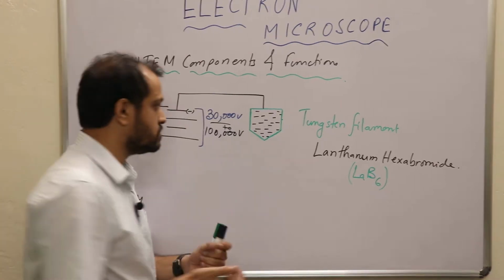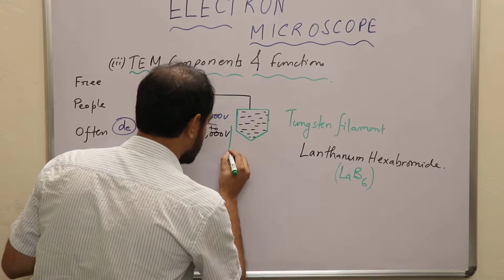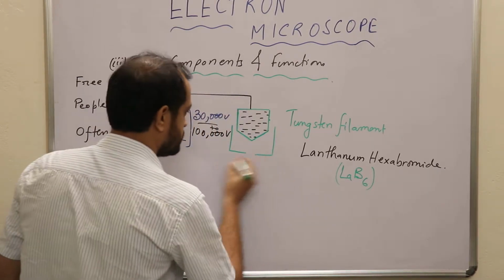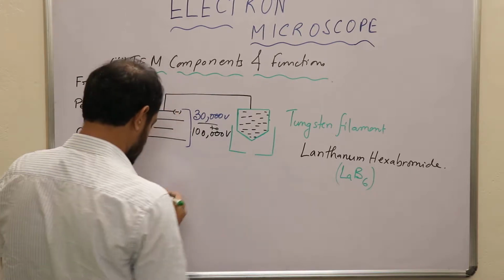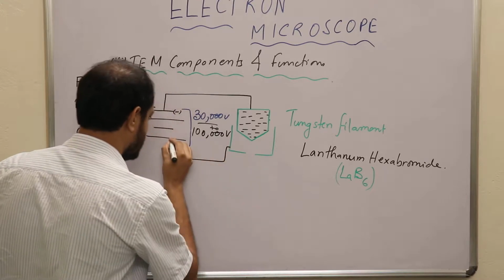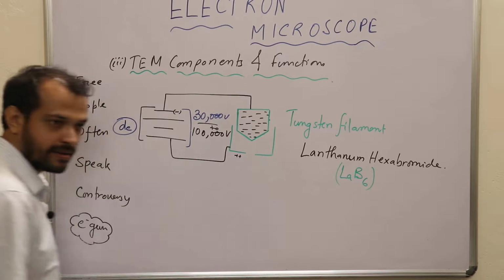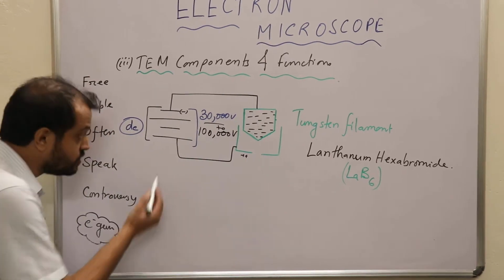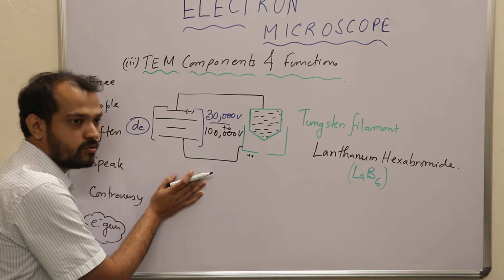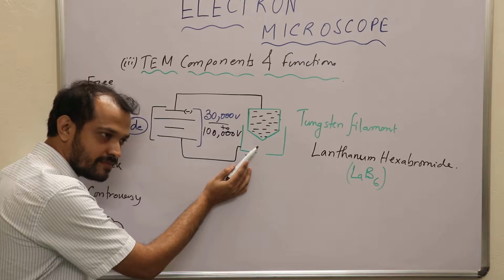Okay. So what we have done is we have produced another thing, a casket-like thing, and this is connected to the positive terminal. That means this is positive, right? Now if we do this, then the whole current will never flow and the circuit is open. Why? Because these two surfaces are not connected to each other, right?